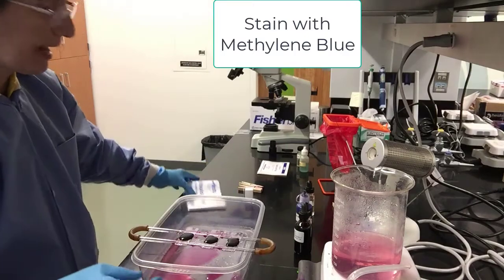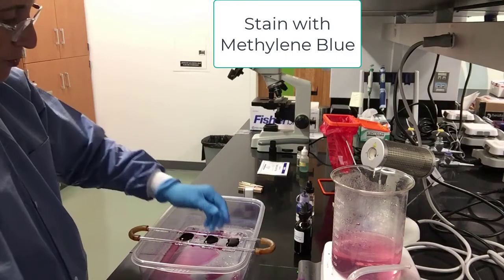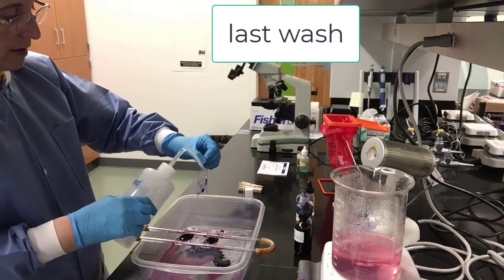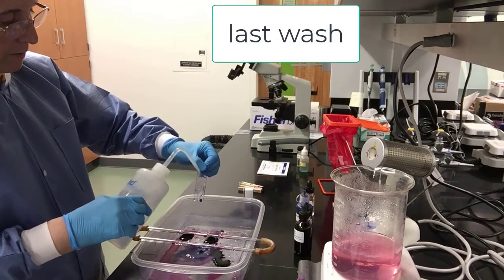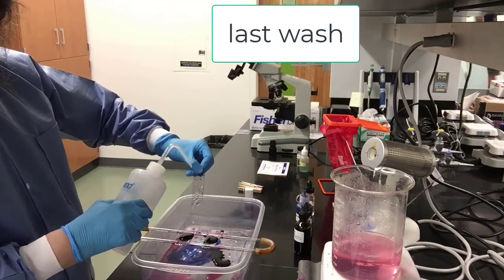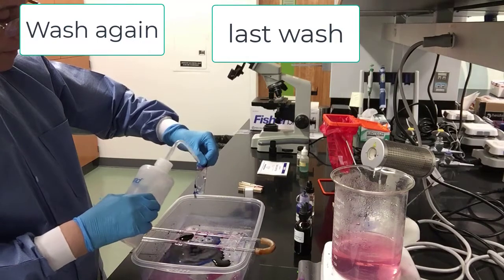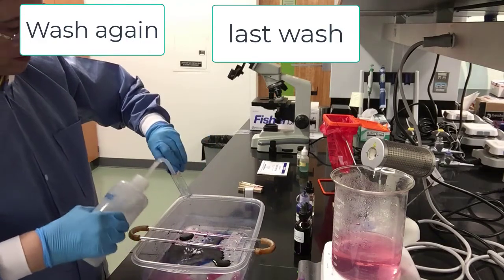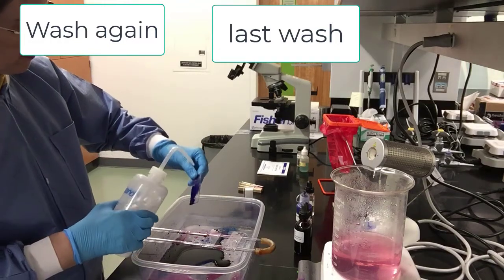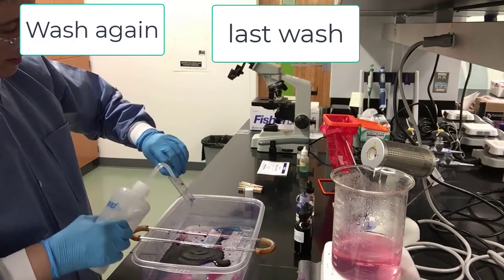We are now ready for the final step before we dry our slides with a bibulous paper. We take our water and we wash one last time. Again, bacteria that are acid-fast positive will retain the carbolfuchsin. Those that are not have been decolorized and will pick up the methylene blue stain. You can see here we have finished the last slide. We have washed it with water.